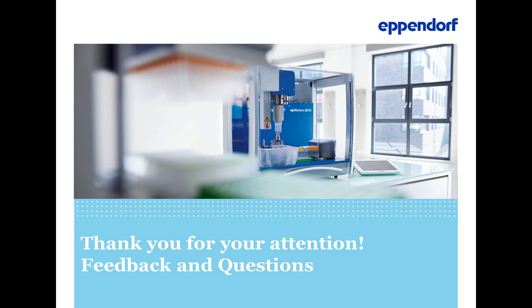Whereas a technical replicate is a sample that comes from one donor or one source and it's been split up into several portions. So let's say a triplicate or a duplicate. The reason why you're doing this is that with the biological replicates, you are controlling your hypothesis, so your experimental hypothesis, whereas with your technical replicate, you are controlling your process. In this respect, let's say your pipetting, for example, or your precision in general.